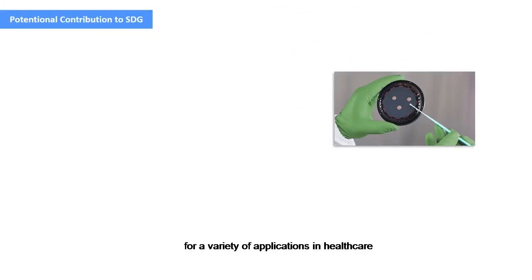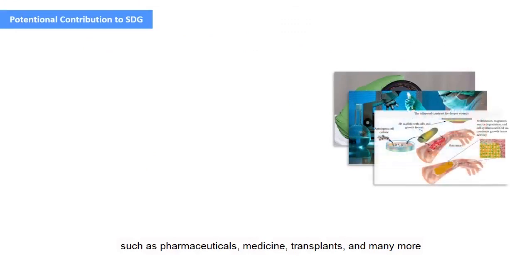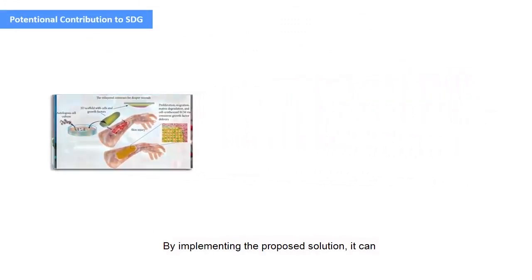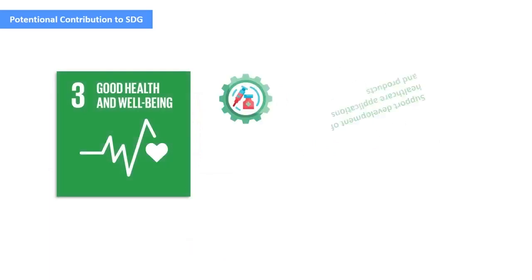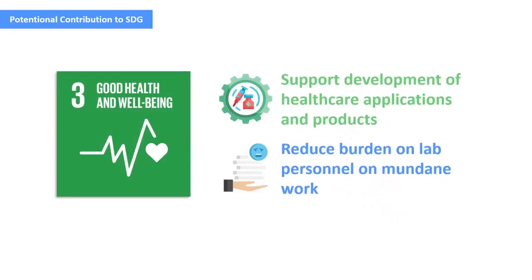Cell culture is used extensively in scientific laboratories for a variety of applications in healthcare, such as pharmaceuticals, medicines, transplants, and many more. By implementing the proposed solution, it can support development of healthcare applications and products and reduce the burden on lab personnel on mundane work, leading to both higher production quantity and value.